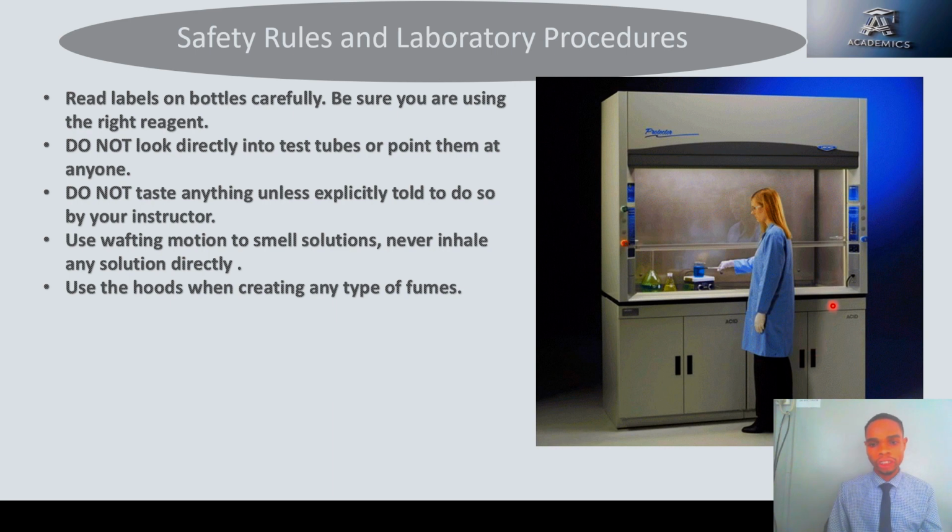Now, so as not to release toxic gases in the laboratory, use the fume cupboard when you are preparing any chemical that can release toxic gas, such as ammonia solution, as it can release ammonia, which is not good for the health.